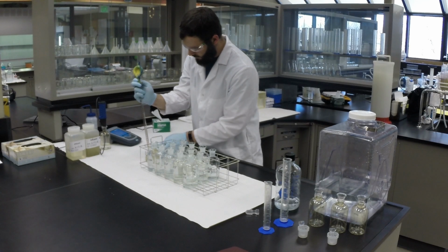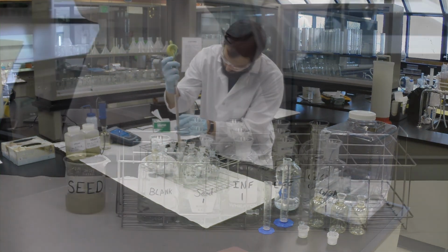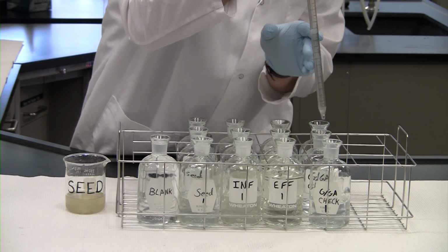After adding all of your samples, you then add 1 to 5 milliliters of seed to each of your effluent sample bottles. This amount may be different depending on your seed strength, but the volume added should be the same for every single bottle in any given run.